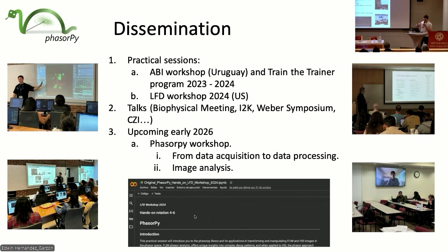So in this part, the library is very, very new. Actually, last month, we released the first version. So we could carry on an entire workshop on that. But we've been introducing it because the majority of the people that come to this kind of workshop are already working with spectral imaging or FLIM. And what I saw is that the majority of them have someone programming, or collaborate with some programmers or image analysts, to ask them to create the code, mainly in Python, to do this kind of process.